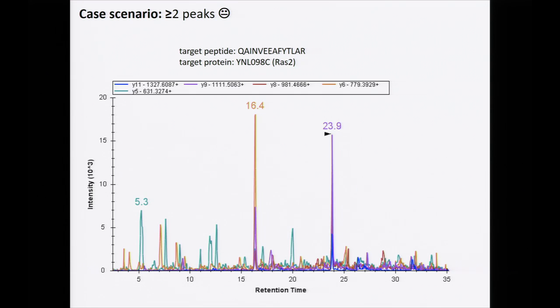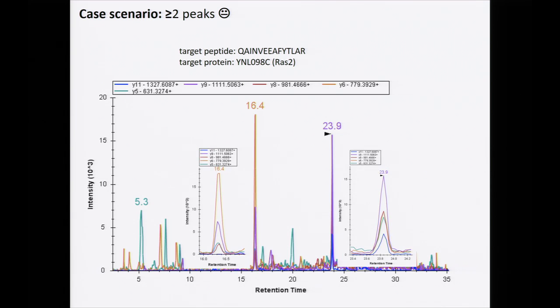You see you're measuring only five transitions here. The interference you observe — even though Q1/Q3 acquisition in SRM is said to give very specific assays — shows that specificity in a full lysate is not always that specific. All these peaks are basically interferences; only one of them is correct. The question is how you identify the correct peak.